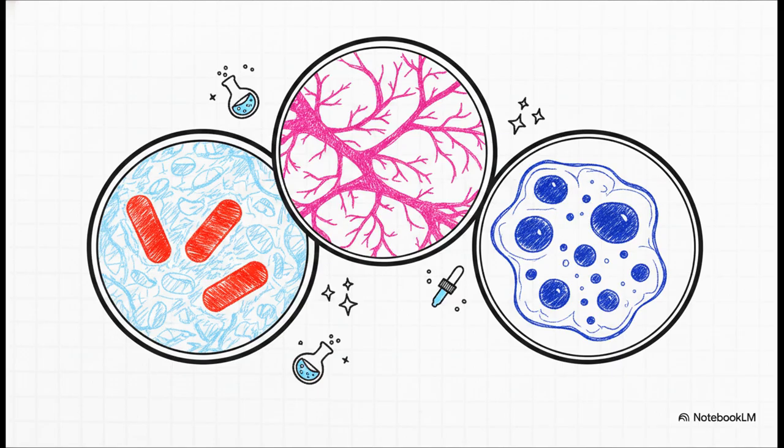against a blue background. Or take PAS, periodic acid-Schiff. Hit tissue with this, and fungal hyphae or mucin suddenly pop in a brilliant, vivid magenta. And if we're looking for hidden iron deposits, Perls Prussian blue turns hemosiderin inside macrophages a striking deep blue. Every special stain reveals a totally distinct microscopic target.